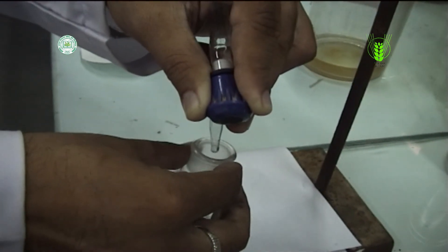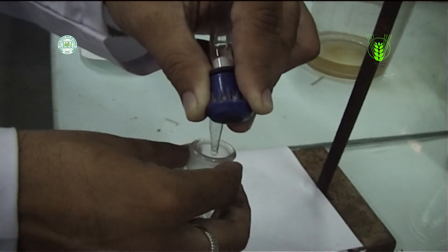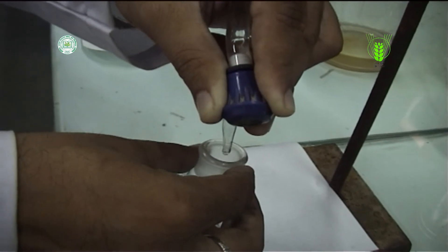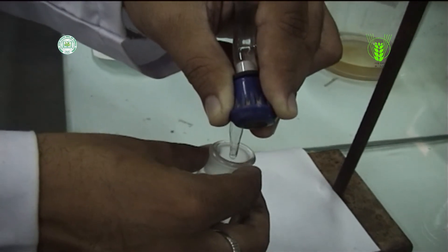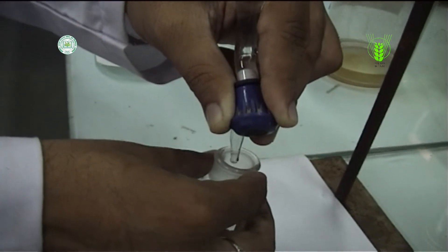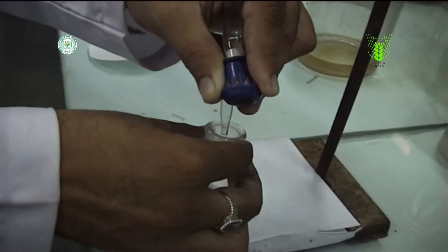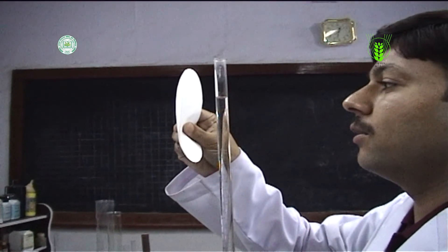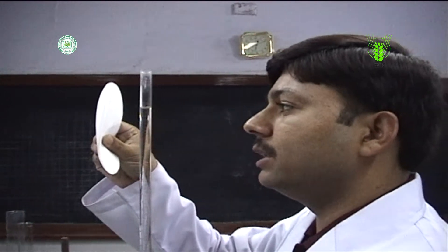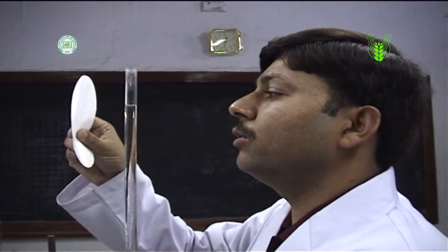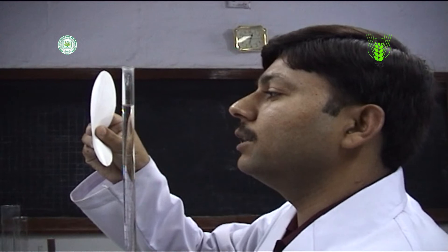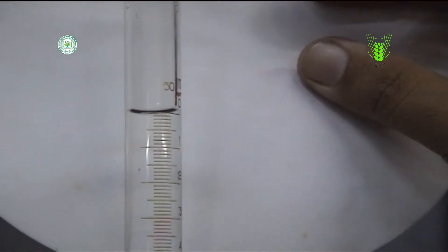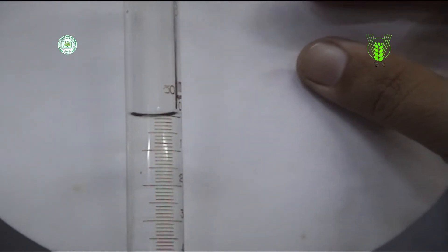Keep the white tile or white paper under the conical flask for clear end point display. The solution should be delivered quickly until a couple of milliliters from the end point. When reading a burette, it is important that your line of sight be in a direction perpendicular to the burette column. Look at the concave bottom of the meniscus which is clearly outlined.